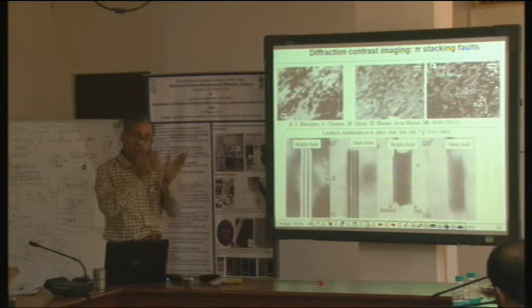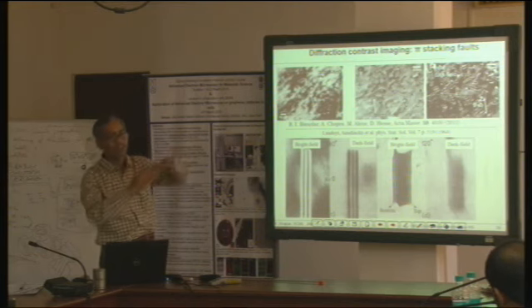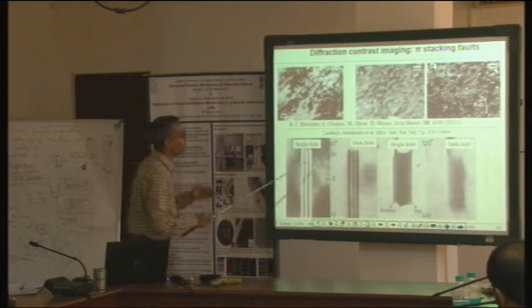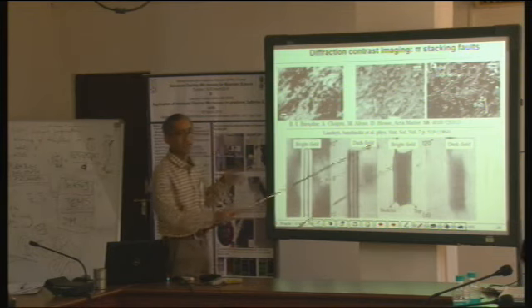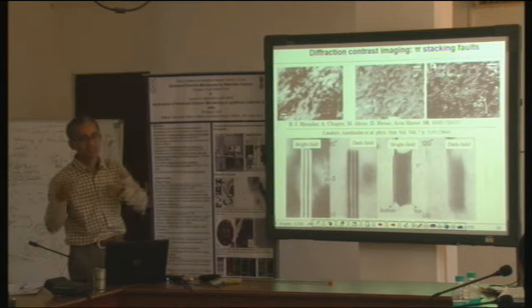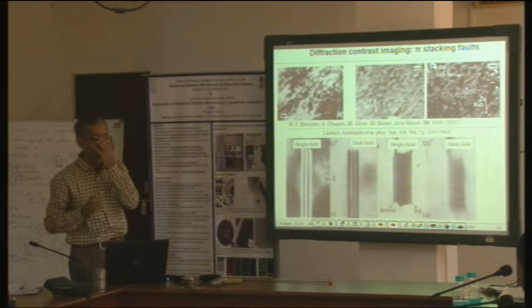Depending upon the contrast and its relation to the dark field contrast, they are able to say which part of that stacking fault image is on the top side and which part is on the bottom side. They are also able to find out whether it is a 180 degree stacking fault or a 120 degree stacking fault, etc. So these inferences can be made by combining observations with calculations and also taking help of theoretical or literature work already published.